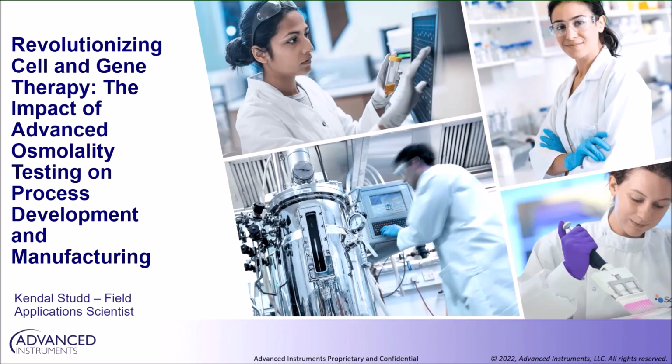For the introduction, today I'm going to be talking about osmolality testing. Some of you may be aware of osmolality testing, some of you may not be. But from Advanced Instruments' point of view, it is a real critical process parameter within bioprocessing, and especially within cell and gene therapy. That workflow, that application of osmolality testing, has a variety of positions throughout the workflow. So today I'm going to talk about various different applications from upstream, downstream, and into fill finish too.